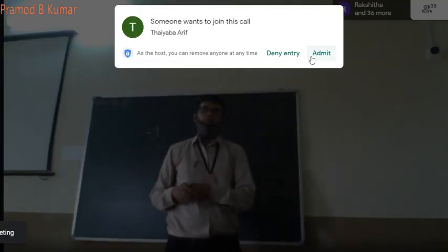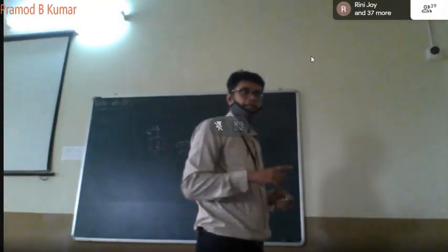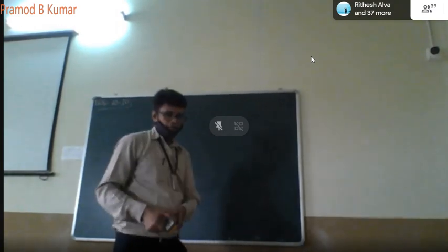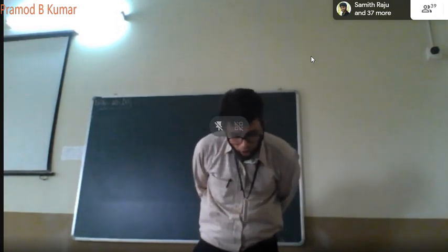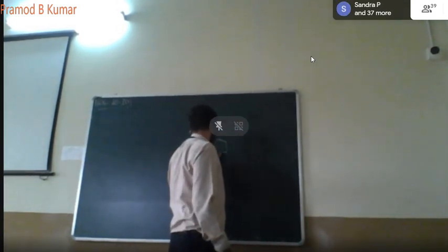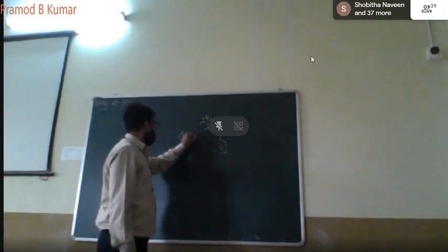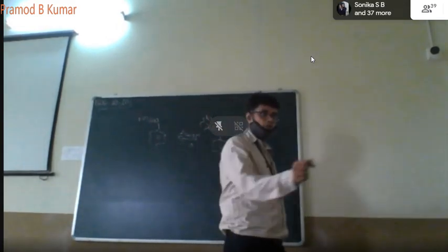Seventh experiment is what? It's preparation of benzoic acid from alkyl benzoate. So what is alkyl benzoate? You take it with R, consider it as methyl benzoate. You treat it with aqueous alkali and heat it. It undergoes hydrolysis reaction. So it's an example of what?